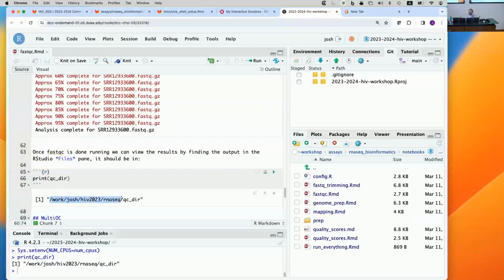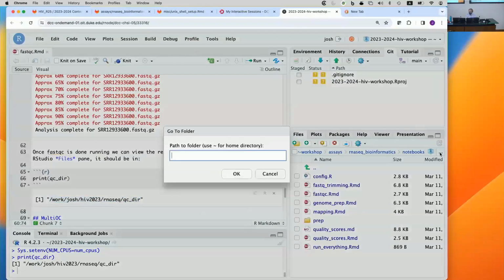The easy way to do this is going to be to highlight that and then copy it. So on a Mac, Command C, on a PC, I think Control C works. Then click on the 3 dots and paste it. So on a Mac, Command V, on a PC, I think Control V works.